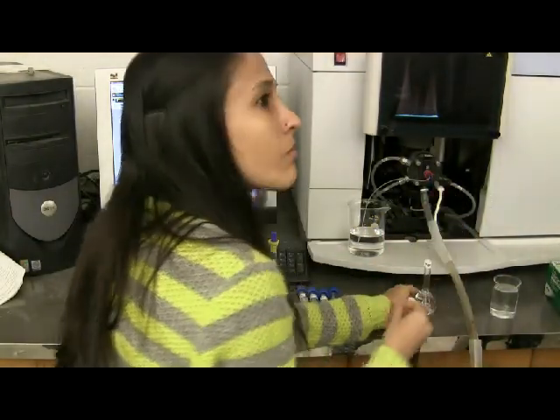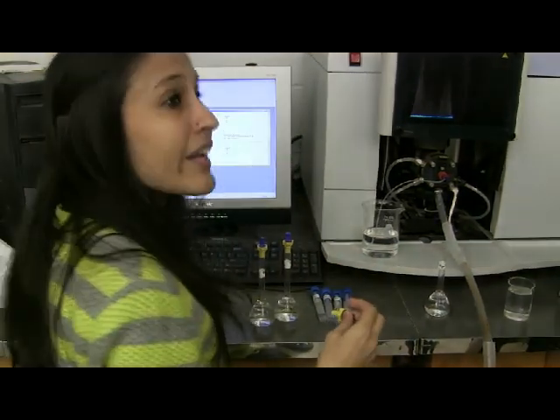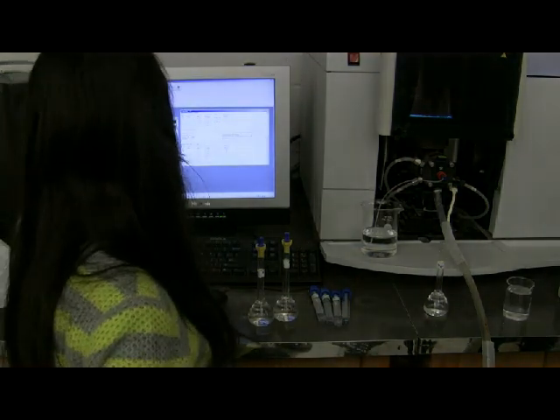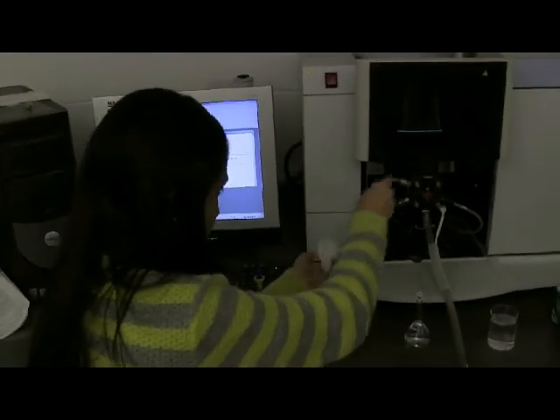How will you know whether it's okay now to move to the other? It says idle. Oh, okay. So you'll know when to. It says it even over here or over here. Just see, I'll show you this run.